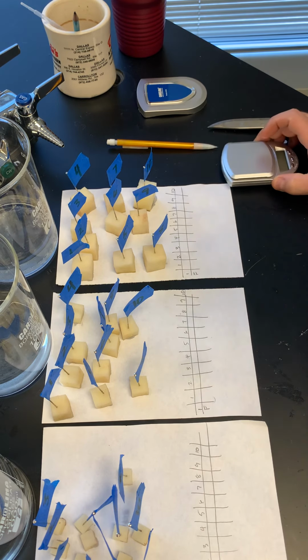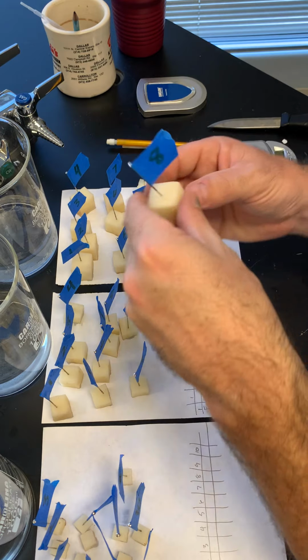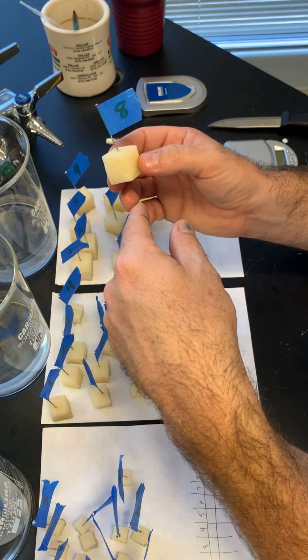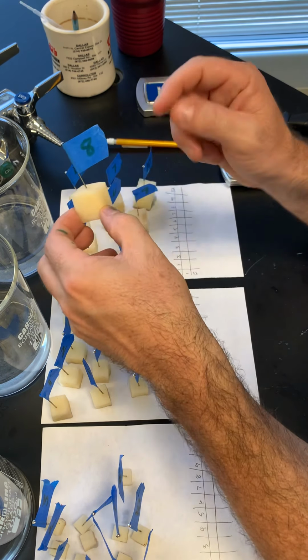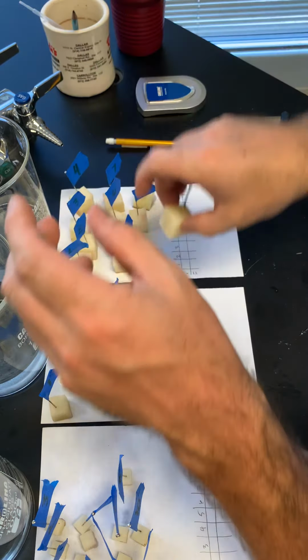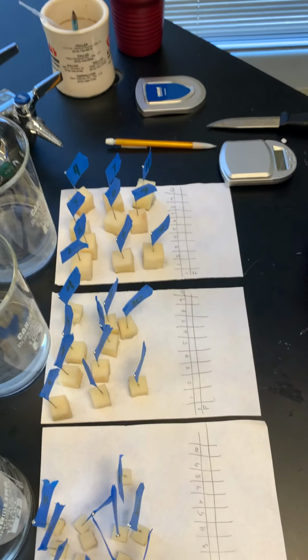So in order to do this, we need to take the initial mass and the final mass. Now, you can see all my little potatoes have flags on them. Because they're all cut exactly the same size, I need to make sure that I know which potato is which. And you'll have to do the same thing. What I did is I just simply got a needle or a pin, put it on the top, and made a little flag out of tape and wrote their numbers on them. That way, when I take the mass as they come out, I know which one I'm measuring.